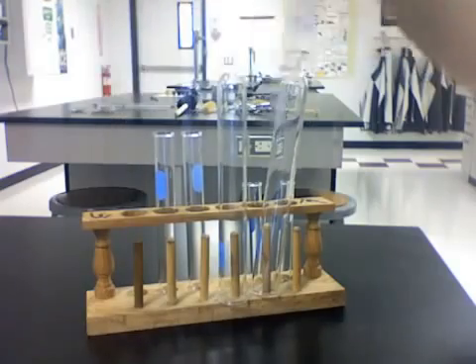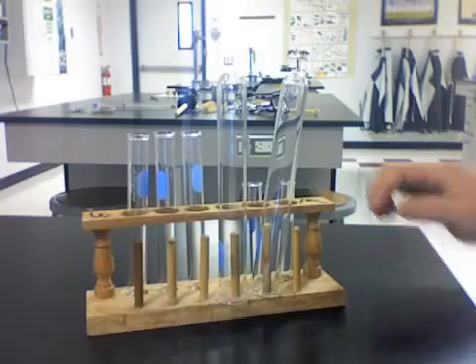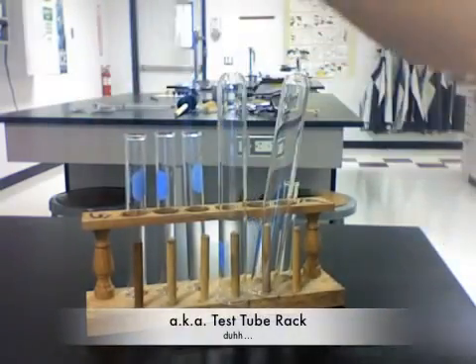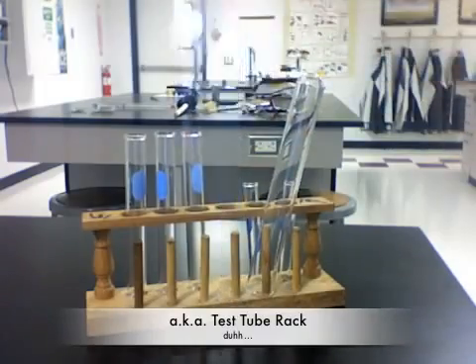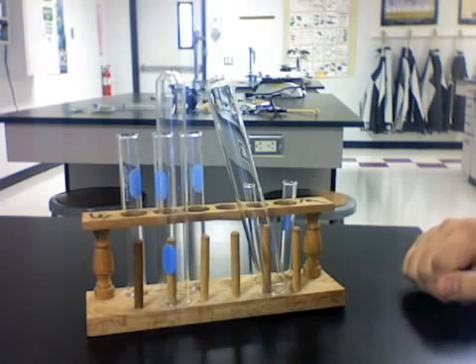Now, what do you think this thing is that we are holding the test tubes in? That's right, it's a test tube holder. It holds the medium-sized test tubes, it holds the little-sized test tubes, and even though it may not hold those, we can still stand them up and let them dry. That is a test tube rack, okay?